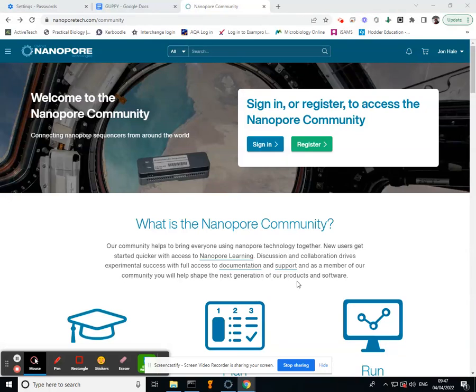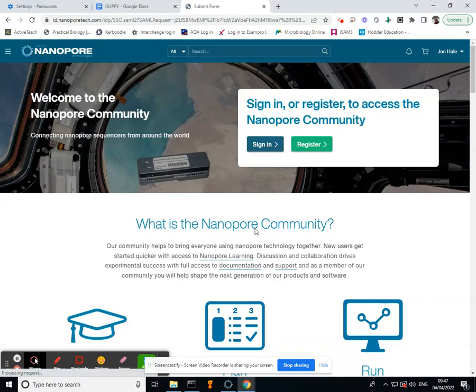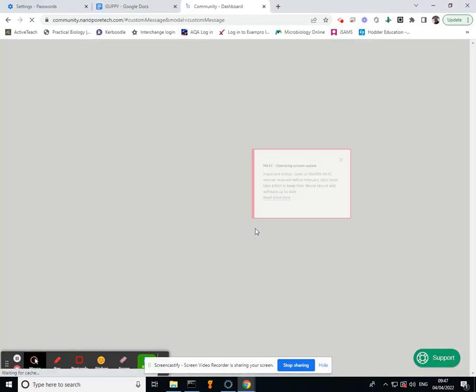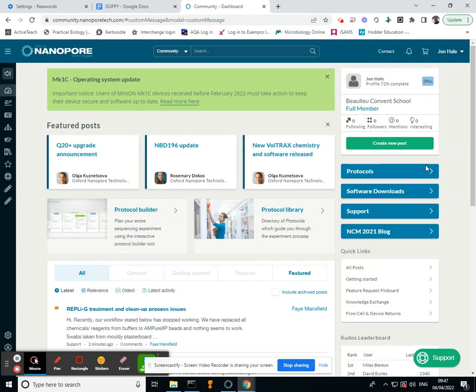So I'm going to give you a walkthrough of how to do some base calling using Guppy. The first thing to do, probably the most important thing, is actually just sign into your Nanopore account.